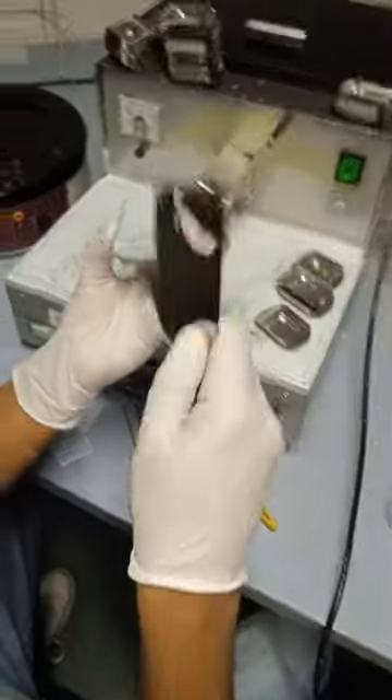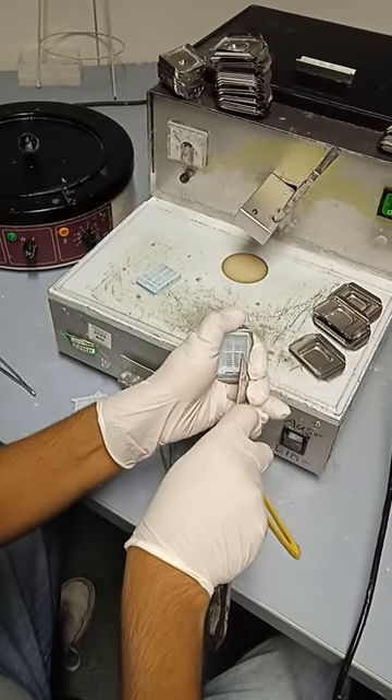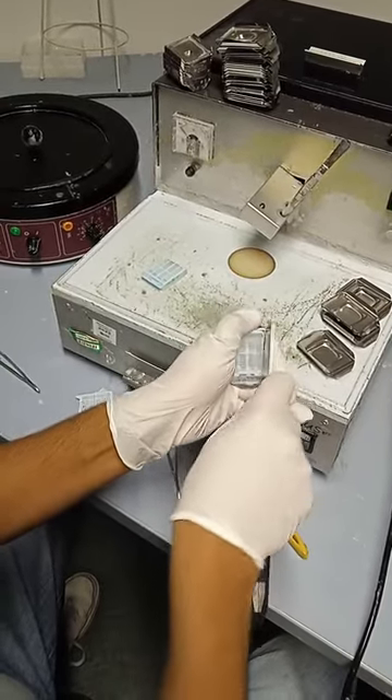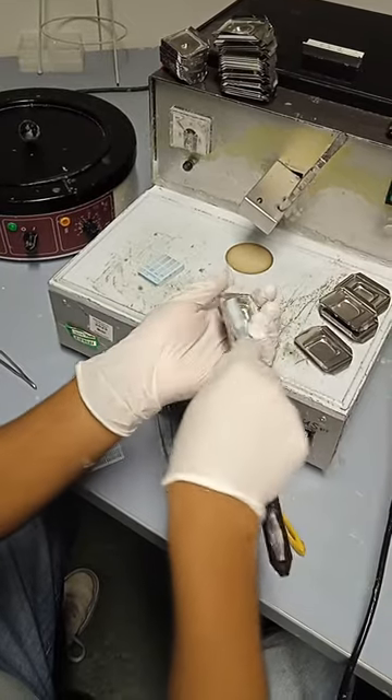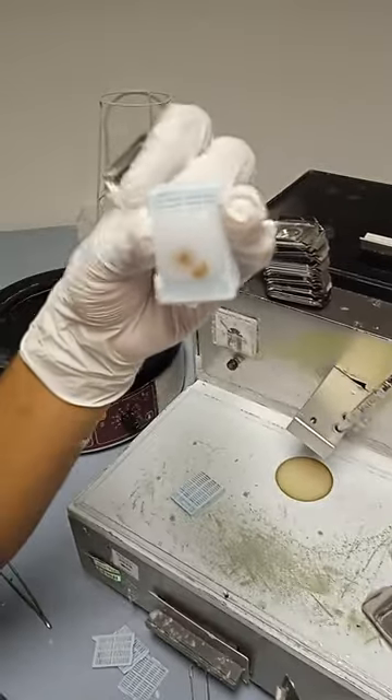What you need to do is take an instrument like this and clean it on this side, this side, and also on this side. It was a little bit rough, but it should appear like this when finished.